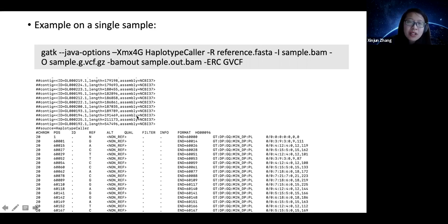I think it has something to do with the HaplotypeCaller: if there's a whole chunk that is non-variant, it will record it as a non-variant block. I don't know off the top of my head exactly how that works, but I don't think you need to worry about missing sites. As long as it's sequenced, it shouldn't be missing. It gives you blocks of non-variant, and for the variants it will have them too.